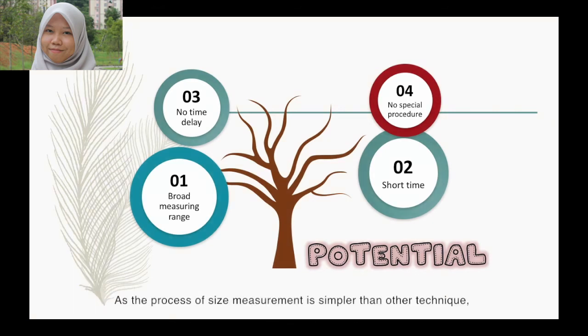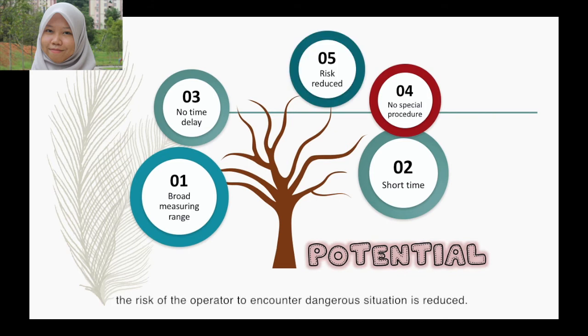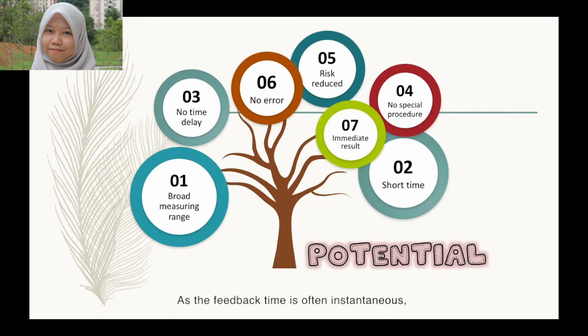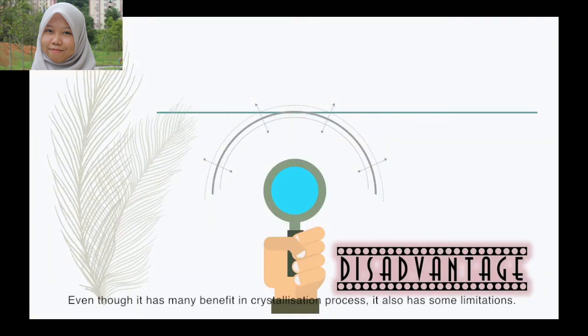As the process of size measurement is simpler than other techniques, the risk of the operator encountering dangerous situations is reduced. Because a real-time particle size analyzer is an in situ instrument, no errors are introduced during sampling, sample transport and sample preparation. As the feedback time is often instantaneous, it allows immediate reaction to faults by additionally widening the databases. Even though it has many benefits in the crystallization process, it also has some limitations.